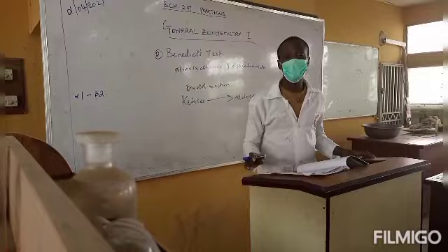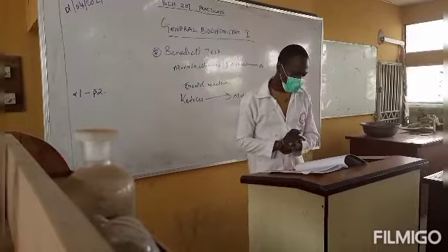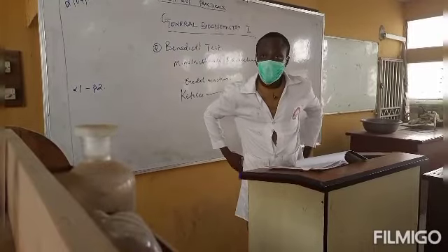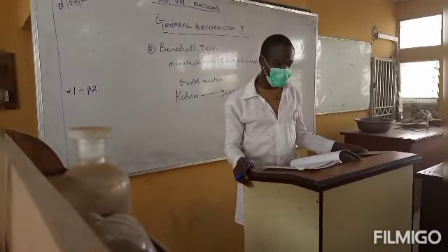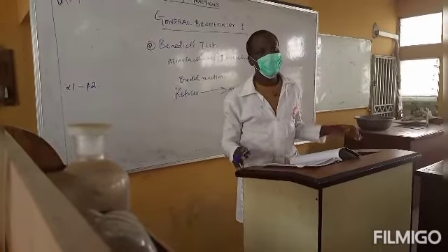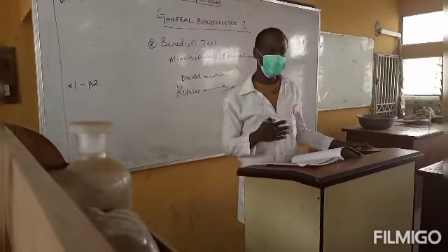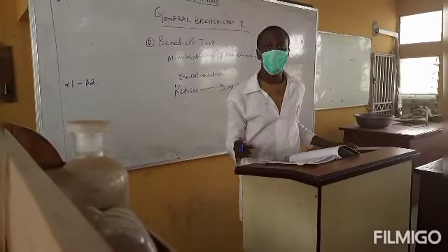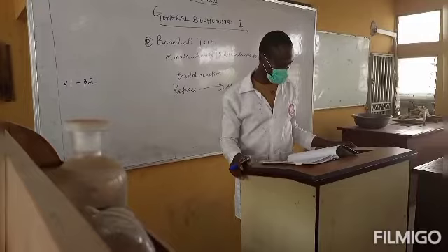The Benedict reagent is just an alkaline solution of copper sulfate, and as I've mentioned before, it reacts with the free ketone group or aldehyde group of the monosaccharide to change color. The normal color of the copper sulfate is blue, and it changes color to reddish brown after the reaction is complete.